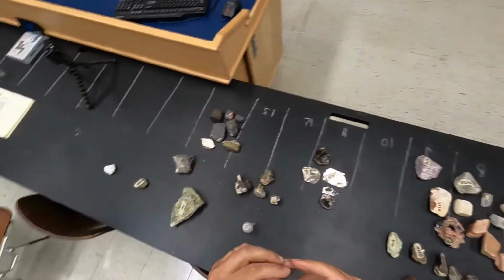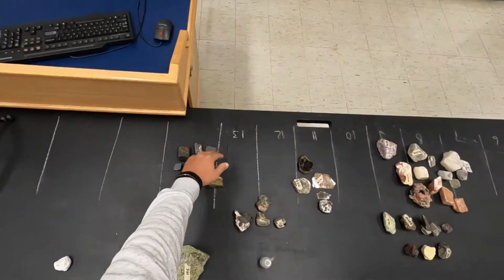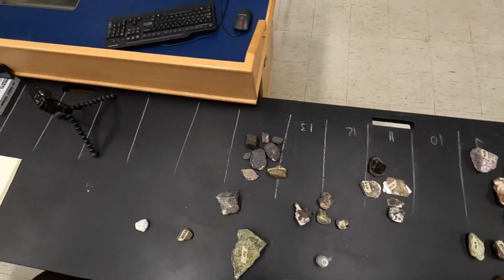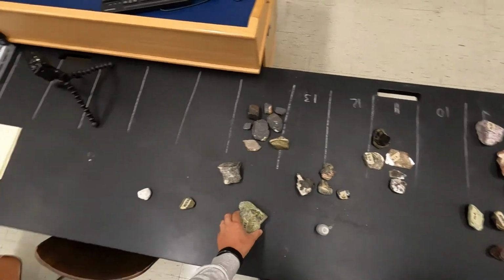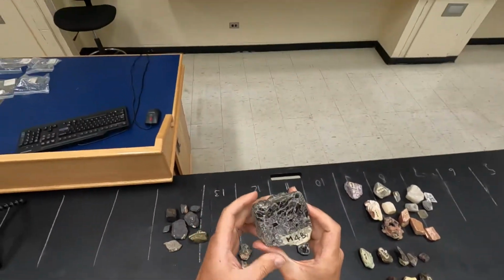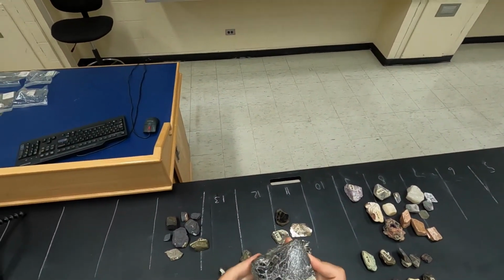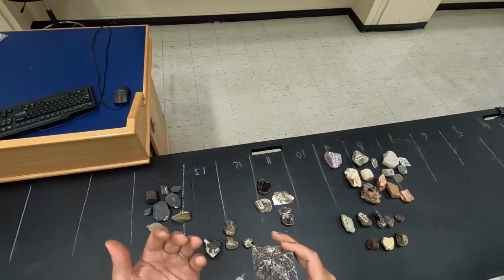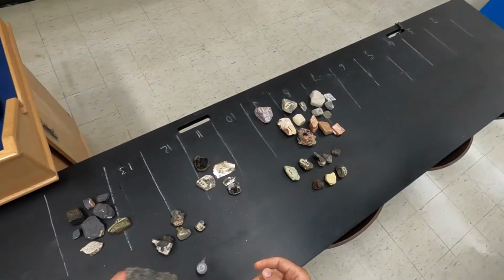So this is an opaque one. It will go in this group and has a similar color, so either magnetite or hematite. Remember, we can use the streak color to check. Then we have other silicates like these that are quite dark in color. You can still see a little bit of translucency, but they are really at the bottom, I think, of that group in terms of translucency, but they are silicates.